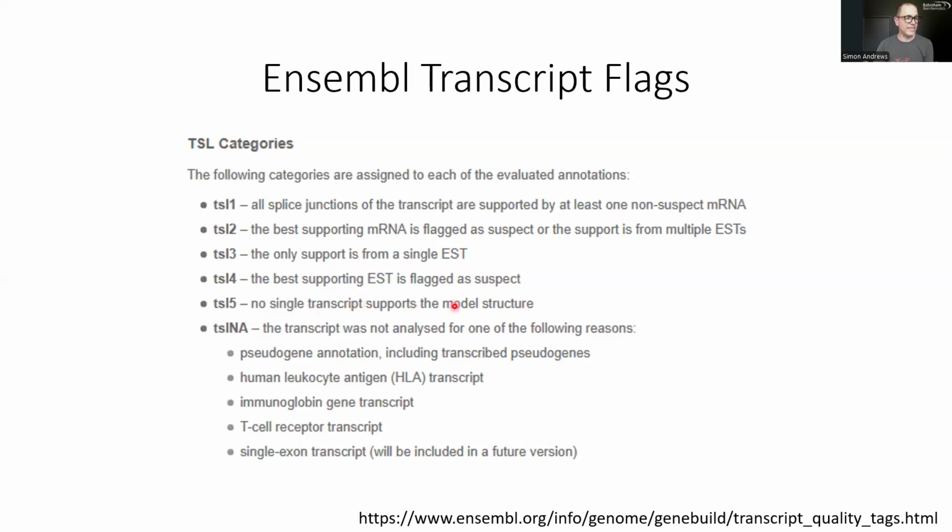And then 5, there isn't a complete sequence deposited that supports this structure. It's pieced together from other things. So you can see that we have this sort of hierarchy, and this is going to get used as part of our quantitation.